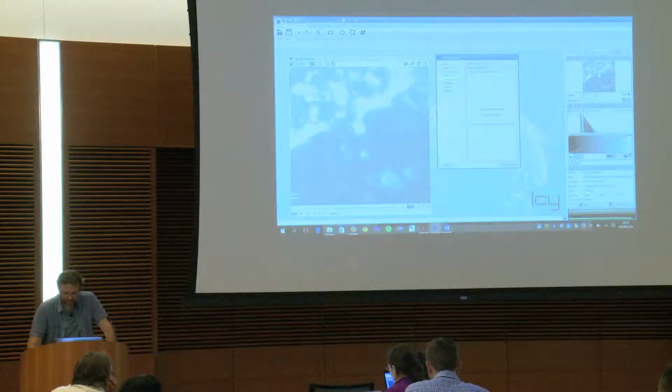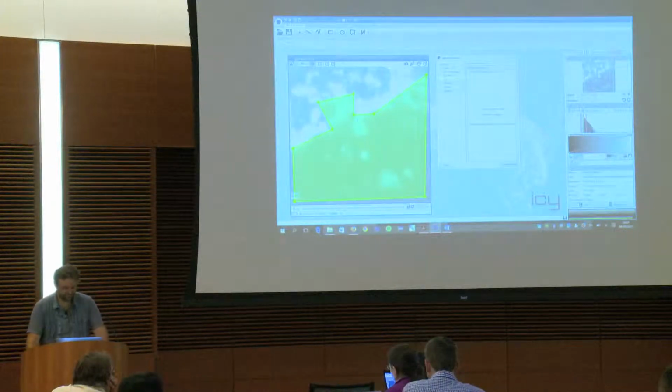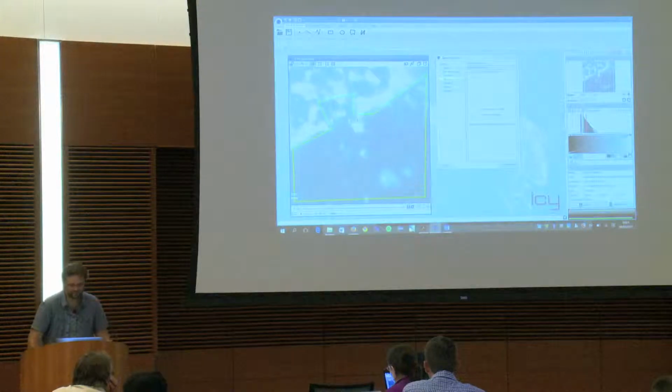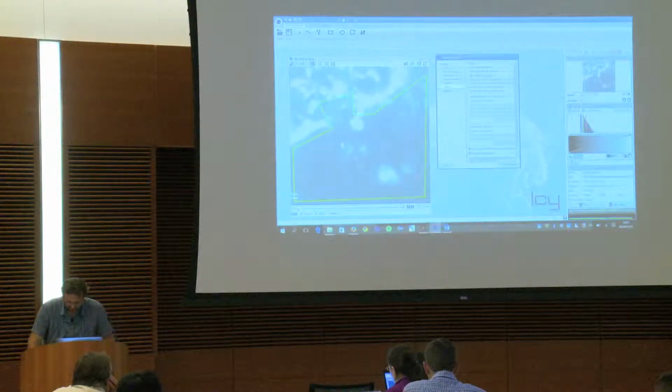And again, I don't want to apply it everywhere, so I will draw my ROI, let's say here. And to show off a little bit, I will always keep the video running like that, so you see that Icy can do several things at the same time. And then we have this filtering. Output, I don't want any output.